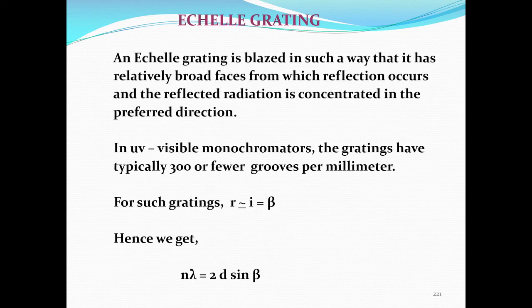So, coming back to the Echelle gratings, you must know about an Echelle grating, because a lot of sales people, when you want to buy an equipment, come and say, sir, ours is an Echelle grating. It is not a blazed holographic grating, or a simple plain grating, but an Echelle grating.